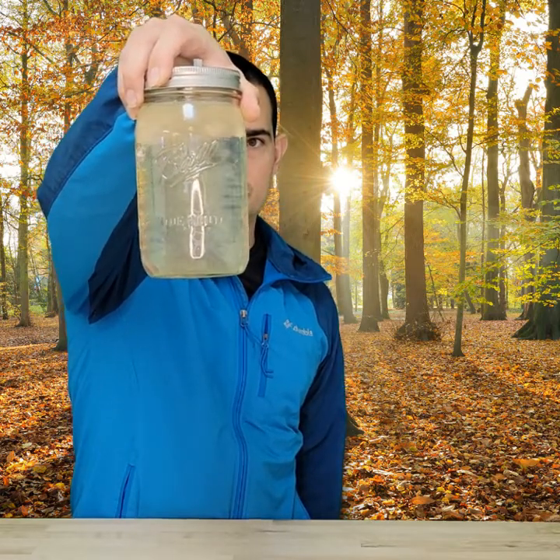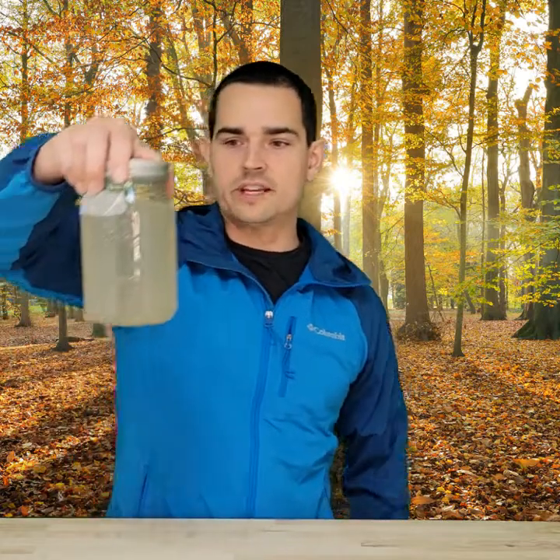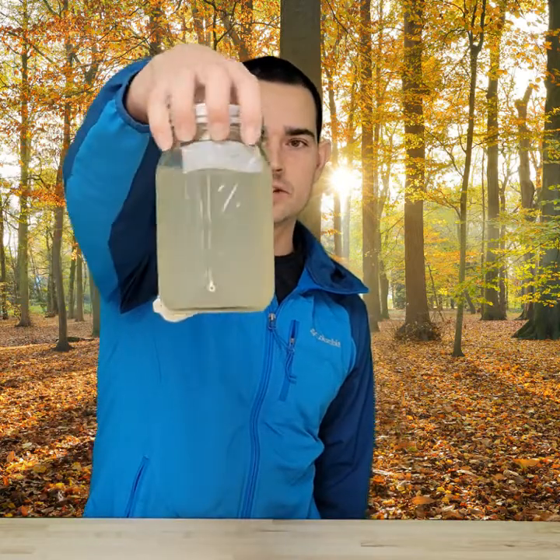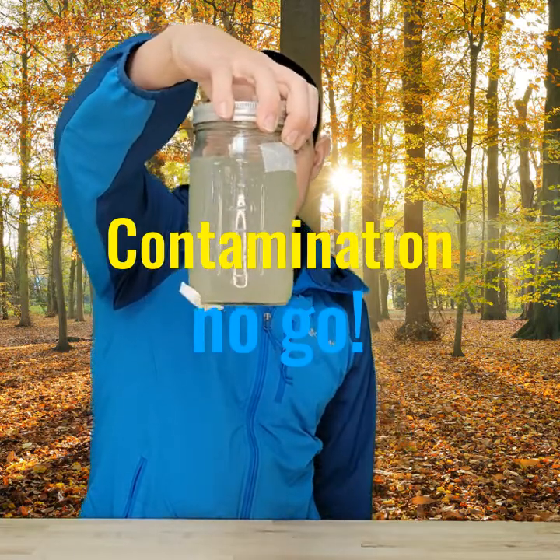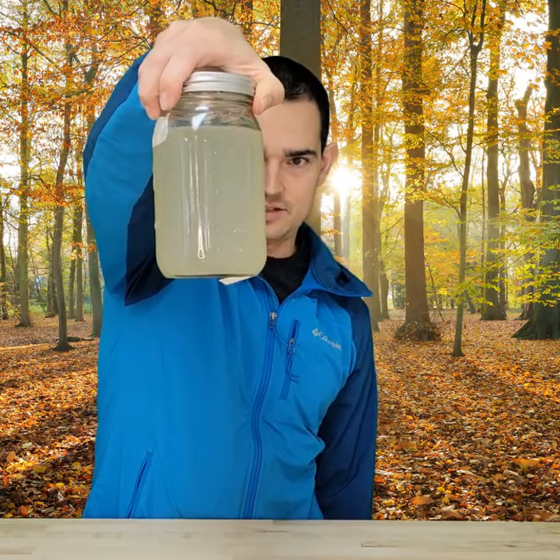Here is an example of a liquid culture you don't want to have. This one is darker — you can see it's not very easy to see through. This is most likely a bacterial contamination, which hinders any visibility through the jar.